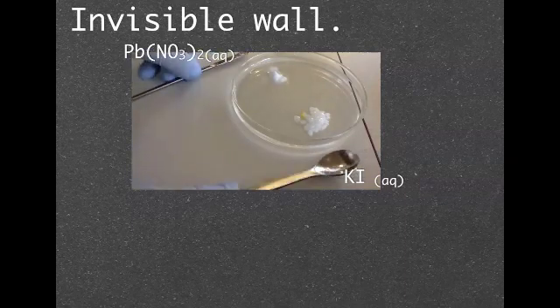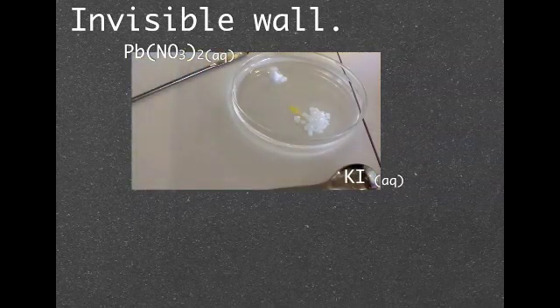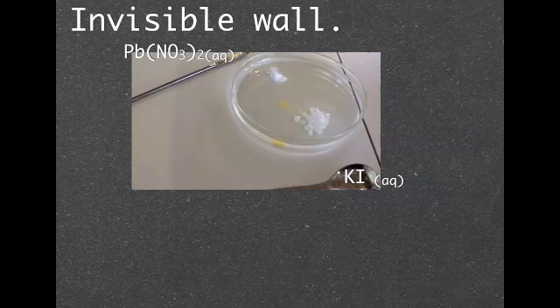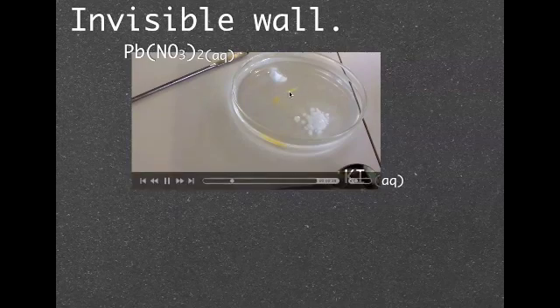What we've got is lead nitrate at the top there and potassium iodide down the bottom. As we add them to the solution, they're going to dissolve and disperse through it. As they disperse, they're going to meet in the middle. And when they meet in the middle, they form a precipitate.